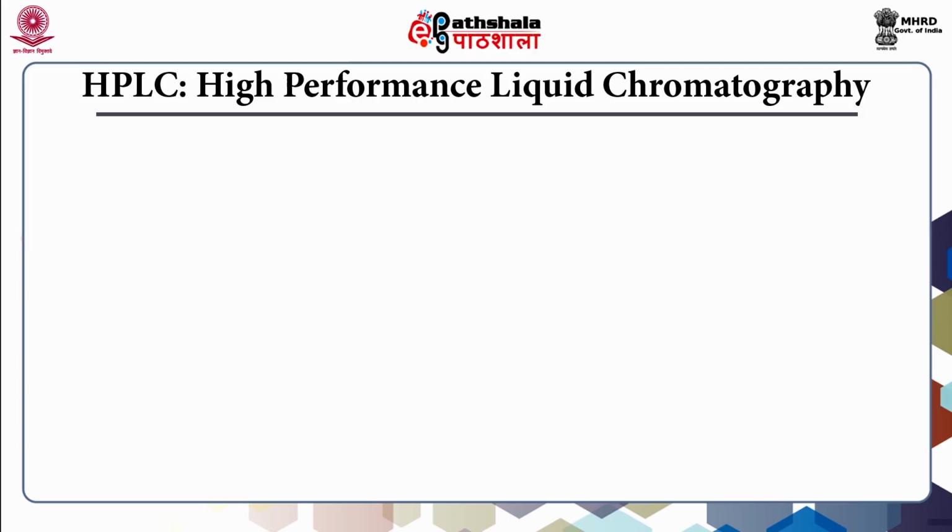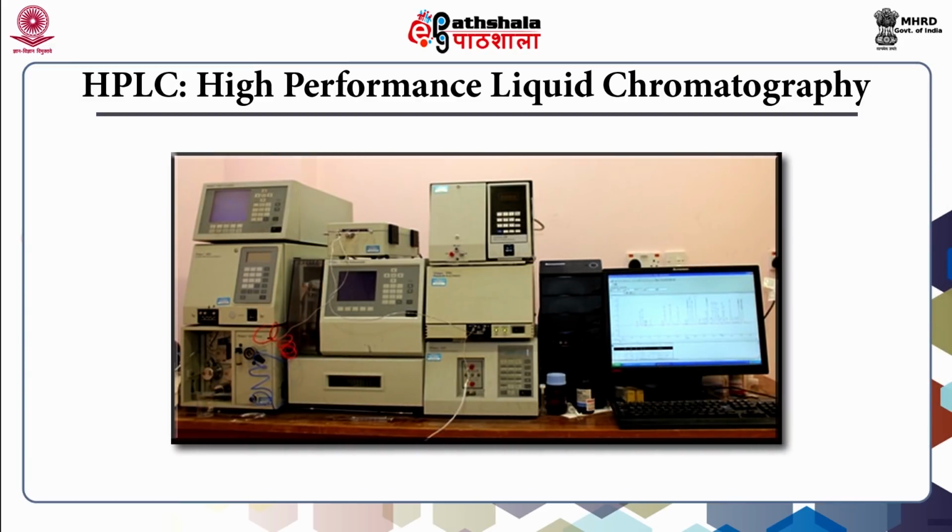Let us start our lecture with an instrument of HPLC, how it looks like. In this slide we are showing the typical HPLC instrument. You can see a computer screen and different pumps and column and also detectors. They are all the different parts of the HPLC instrument.